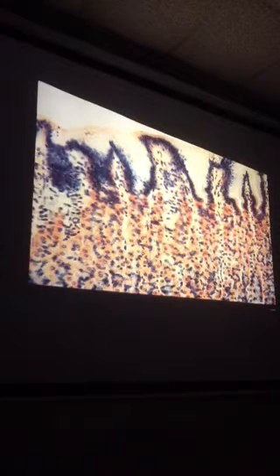And then clustered in the pit are mucus cells. Here, thousands and thousands of mucus cells, part of your GMB, helping to protect the wall of your stomach. And then as you descend into the gland, you see the parietals, dominant, big, angry-looking cells here.